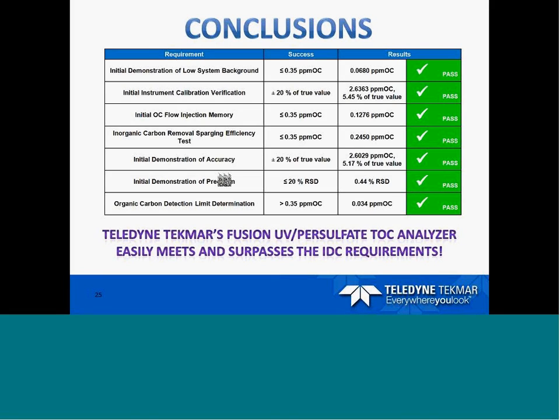You're also going to be running continuing calibration checks. Usually before you run any samples, you have to run a continuing calibration check at the low level. It has to be somewhere below 0.7 ppm, I think it is. So if we ran around 0.5 on our curve, you're going to run a continuing calibration check at 0.5 ppm.